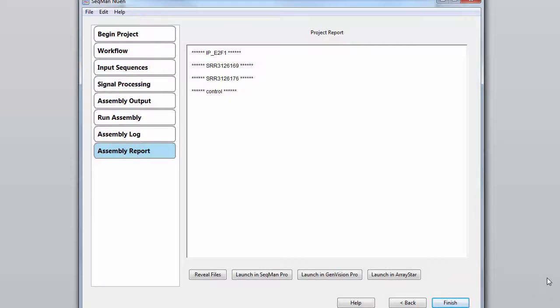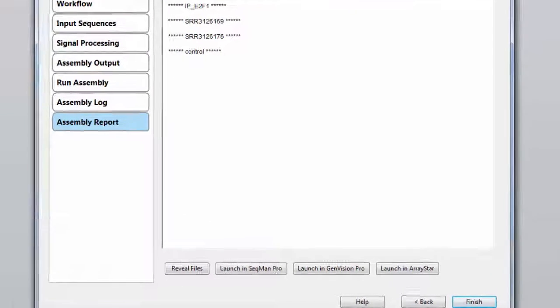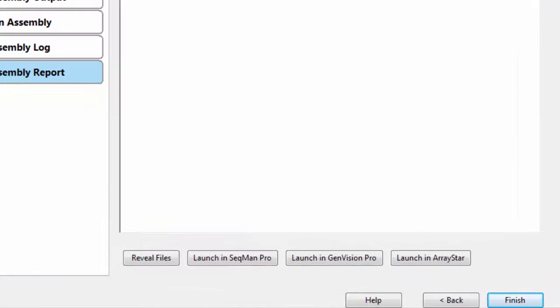Once the projects have successfully been combined, we are ready to explore and analyze the data in ArrayStar.